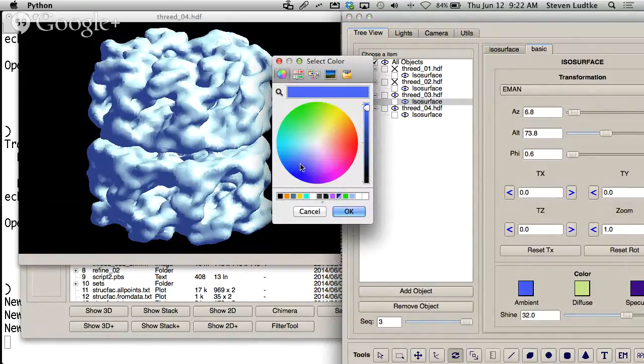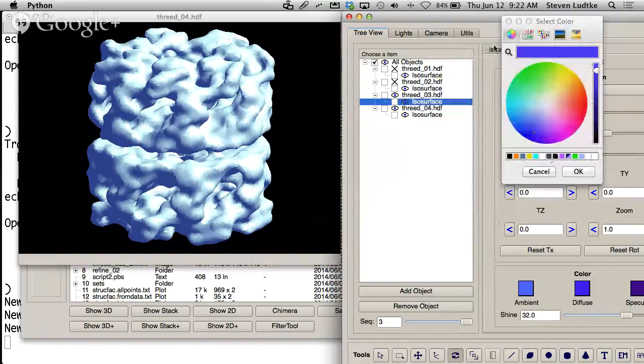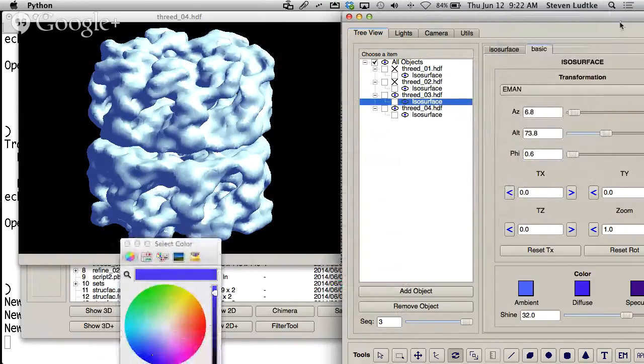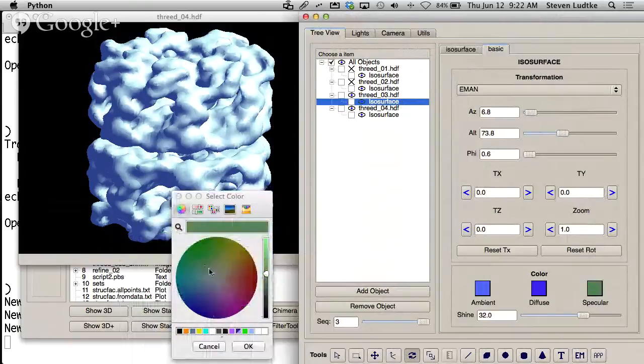Okay, there's not much ambient light present in this image. That's why it's looking more blue. Let's try diffuse. Hang on, why am I not? Huh. Something is not working as expected. Somehow I'm still not getting any updates in the display.